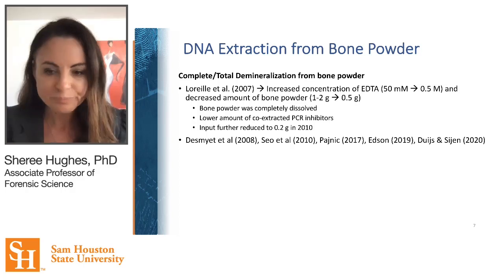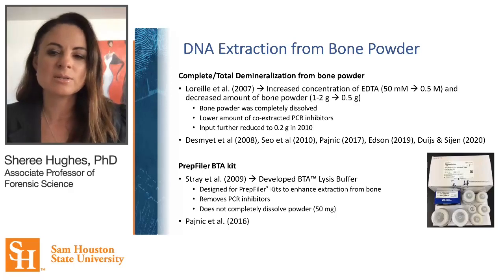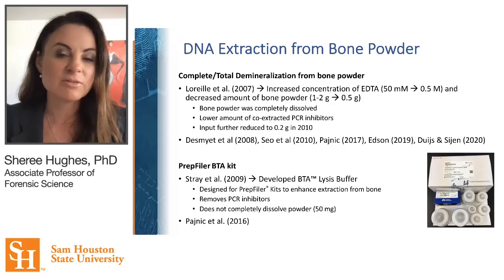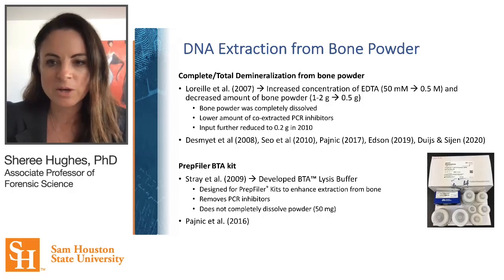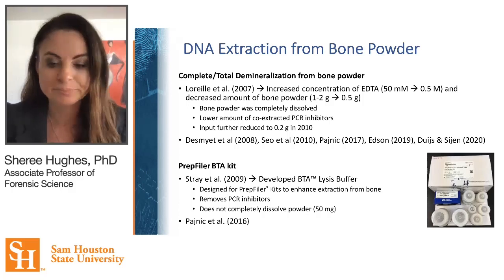demineralize that powder. Now, the PrepFiler BTA kit was released by Thermo Fisher, and it was developed with a very aggressive lysis buffer as well for bone and tissue samples, bone and teeth. And again, we wanted to incorporate this in our lab for various projects. And again, both of these methods are relying on extracting from bone powder.